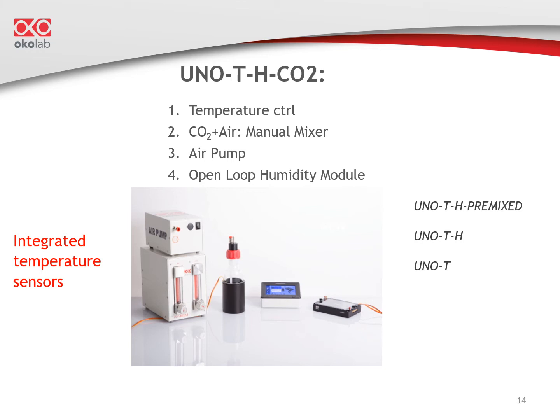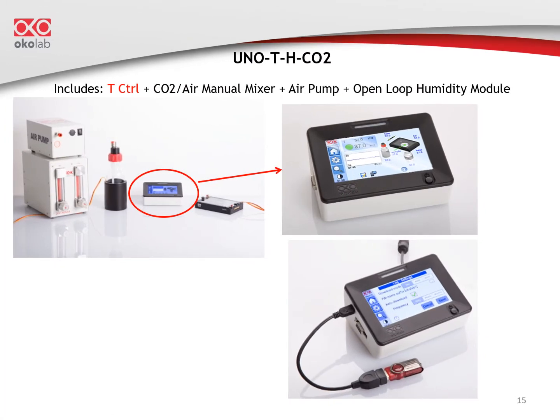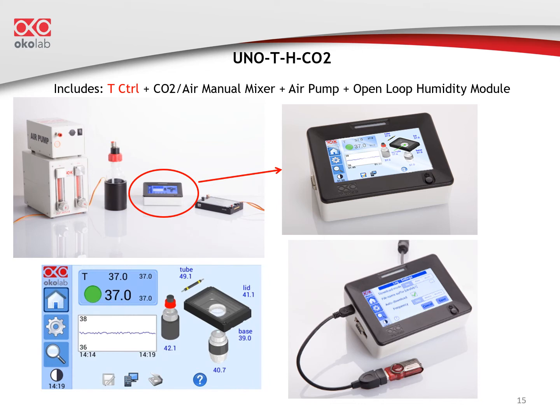UNO is compatible with all Okolab heated stage top chambers. Let's see it in more detail. The temperature controller is digital. The user interface is again user-friendly and intuitive. Similarly to OkoTouch, UNO allows you to log the data either on external storage or on the onboard memory.